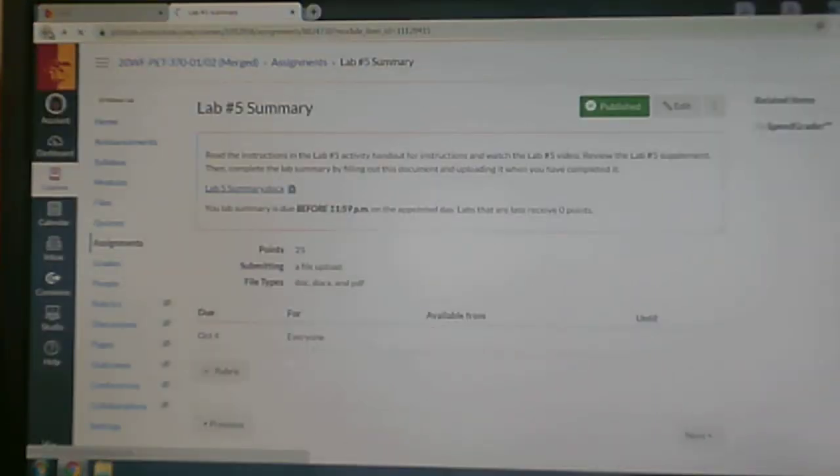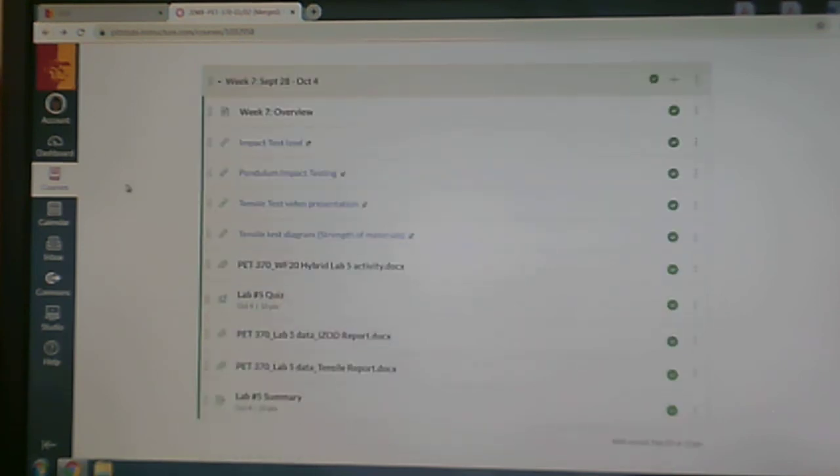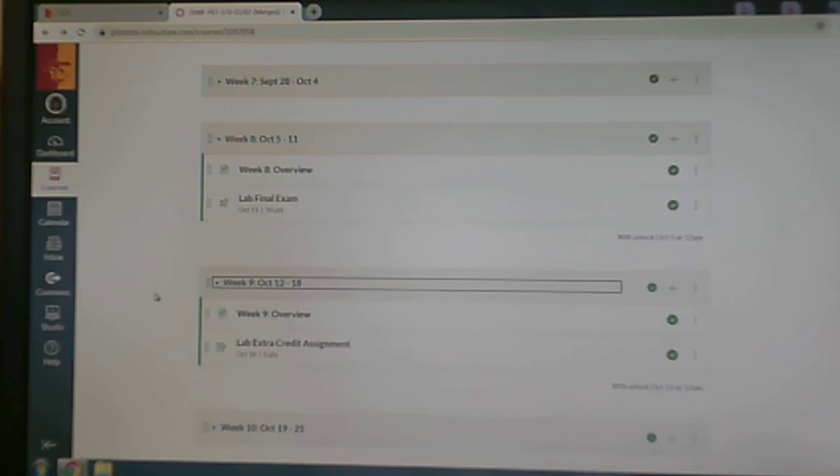So now we have looked at all of the samples of our two experimental resins, those being Lustran and Lexan, by two different thermal methods, a spectroscopic method and mechanical method. So now we should have a very good idea of which one of these samples is Lustran and which one is Lexan. And this is our last lab activity. The only two activities that follow this are your lab final next week and your extra credit assignment the week after that, which I'll do a very short video for both of those together.